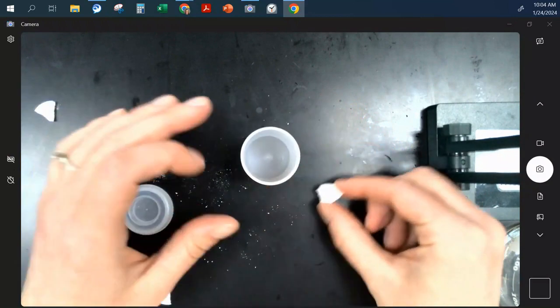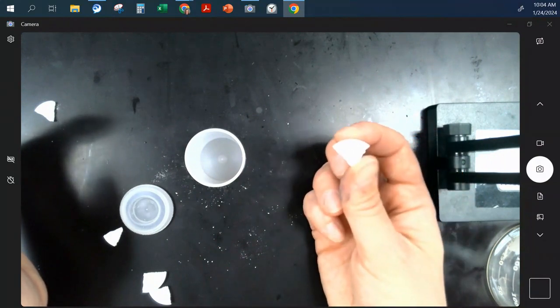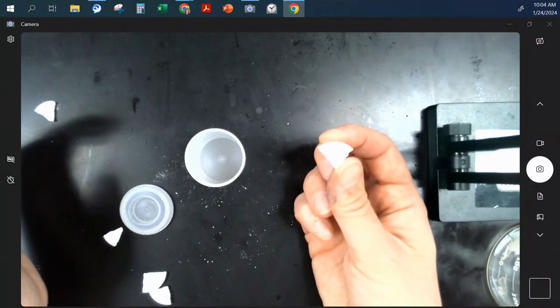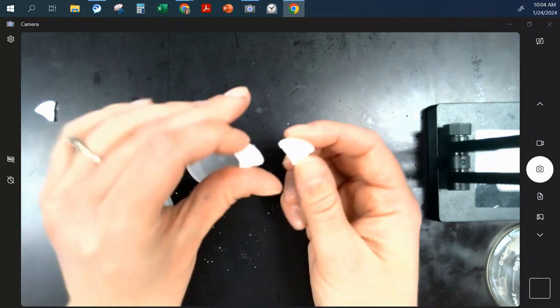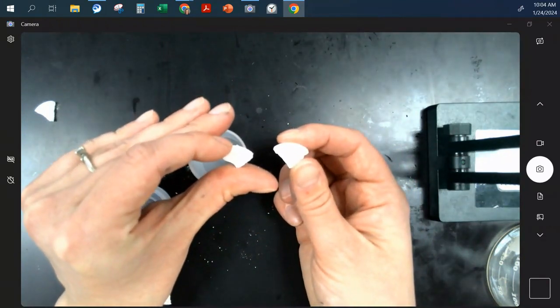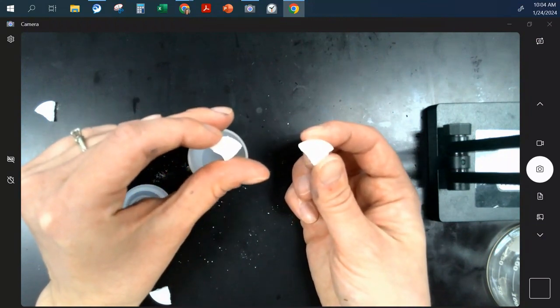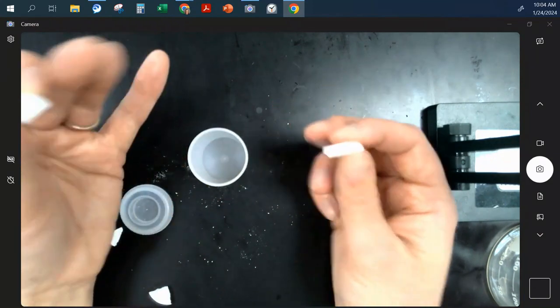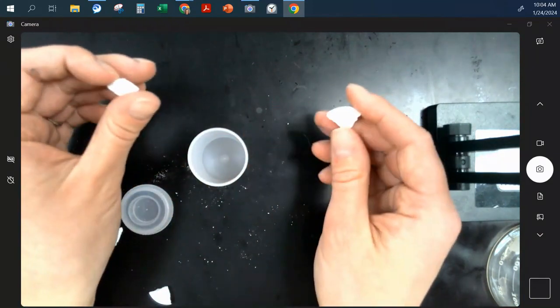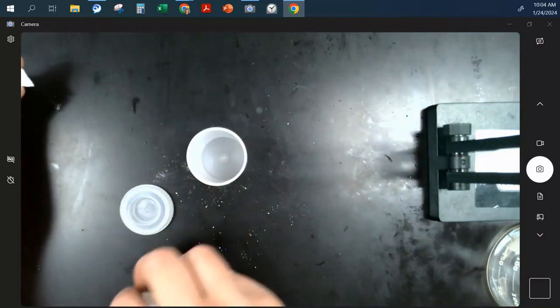This one would be another one where we could measure the particle size. How could we change the particle size of this? Find a similar one and split that one up. Yes. So maybe these are similar in mass, and then maybe this one we could crush. We have mortar and pestles. You could try that. So this would be a good one to measure concentration, temperature, or particle size. So another one that you could pretty much do all of those.